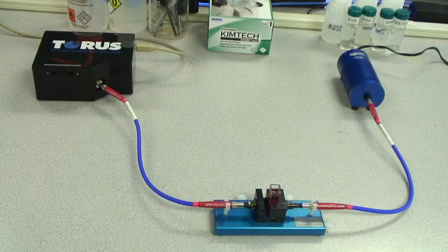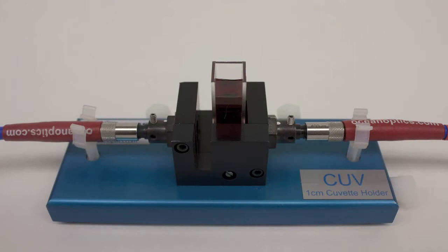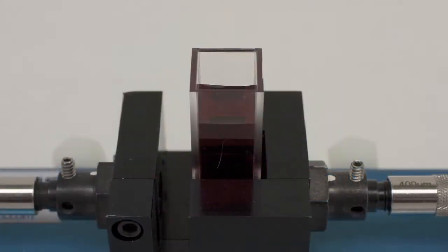High throughput and low stray light are great for measuring solutions with high optical density.